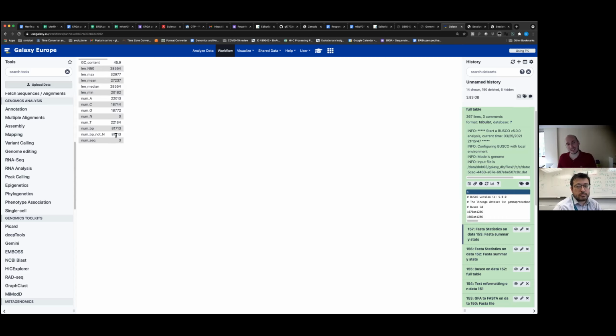I mean, it's not necessarily junk. It could be a real sequence in the E. coli pool of cells. You always have this. Even with a zebra finch, you will have some sequence that is maybe mutated in a somatic cell with respect to another somatic cell. So it's possible that you actually get something like that.